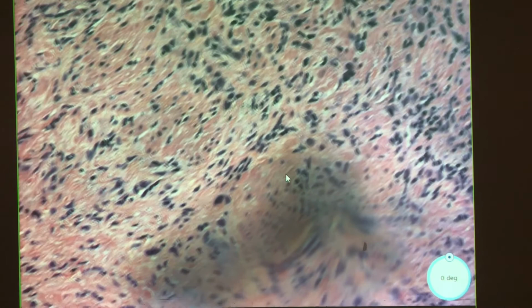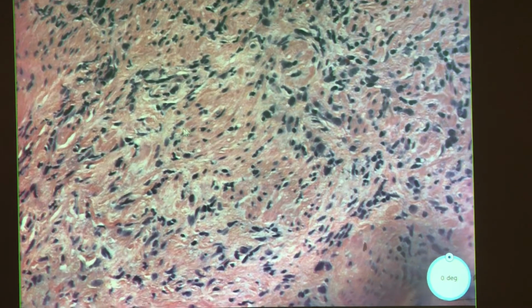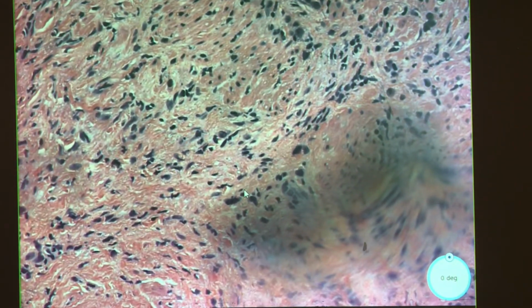Take another look at those cells. Like these cells here? Mm-hmm. Yeah, they are large. I mean, that's why I said this looks funky. Yeah. And I was like, come on, you can do it. I believe in you.